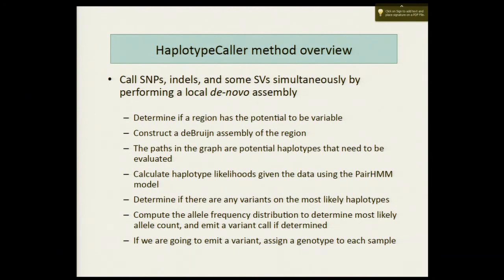Oh, sure. It's not going to assemble an entire genome. No, no, no. It's local de novo assembly, is the idea. And you can push that to thousands of bases if you wanted, but it's never going to do a full whole genome assembly. It's just a trade-off in terms of efficiency, right? So, any other questions? Lots of questions, yeah.